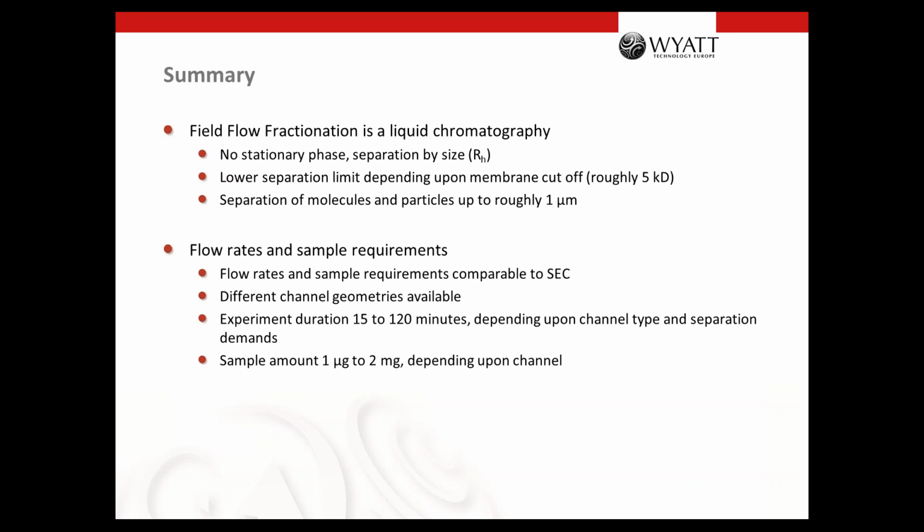The flow rate and sample requirements are comparable to SEC. Usually we use a little bit less sample because of the missing stationary phase, and get better signal to noise. Due to the demands of the separation, we can use different channel geometries and different channel heights. The duration of a separation is roughly between 15 and 120 minutes. And the amount of sample can differ from 1 microgram for an analytical run up to 2 milligrams for a semi-preparative run.